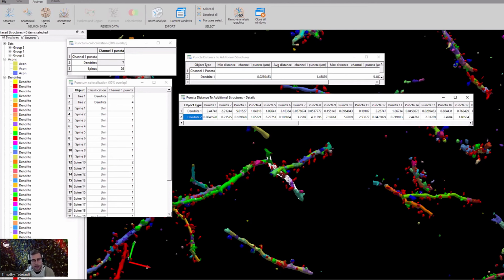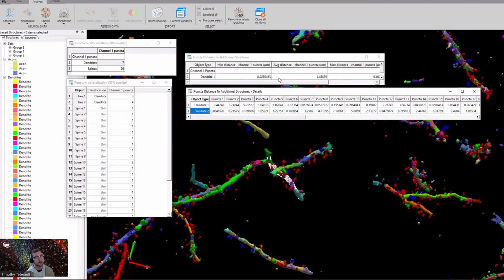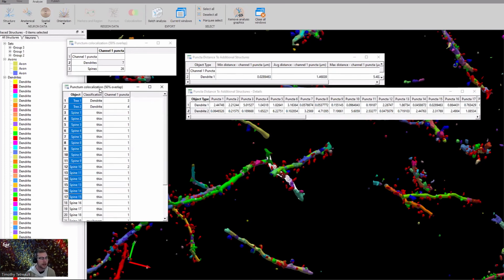Are the puncta analyses available through the Neurolucida 360 system as well? We do have the ability to generate puncta. The analyses in Neurolucida 360 Explore are essentially the same. We're still working on getting these detail analyses up and running in that program, but you should be able to do the exact same processing and creation of data in Neurolucida 360. So thank you for that question, Katie.